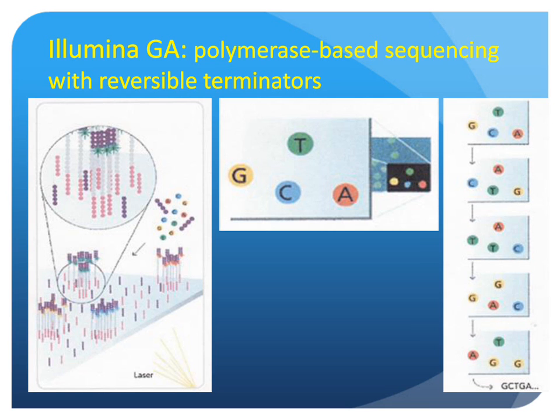Because the nucleotides are blocked, only a single nucleotide can be added. Subsequent to that, the photograph is taken, the blocking groups with the fluorescence color are removed, and this is ready for a second cycle. And then each cycle, one base at a time, sequencing by synthesis is done. They are then lined up together, and through this, one can generate a sequence at each of the individual clusters.